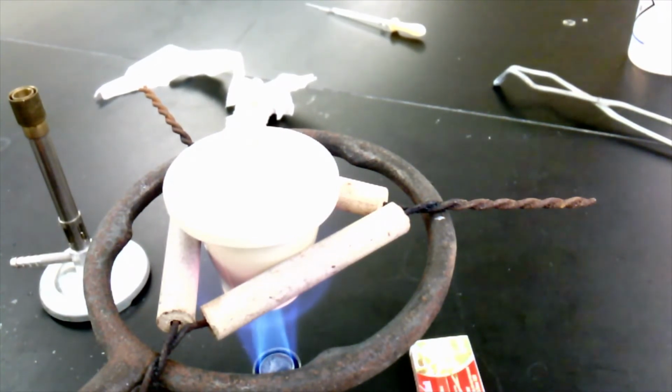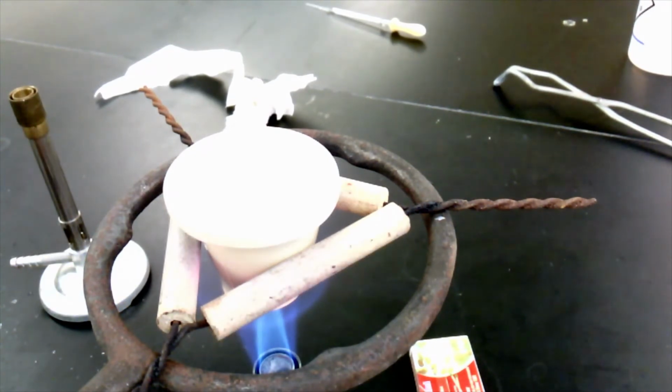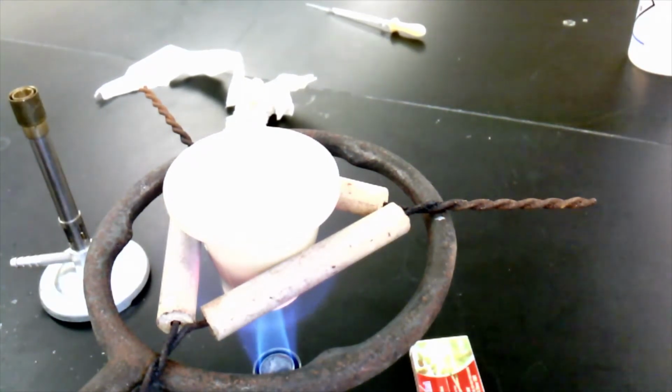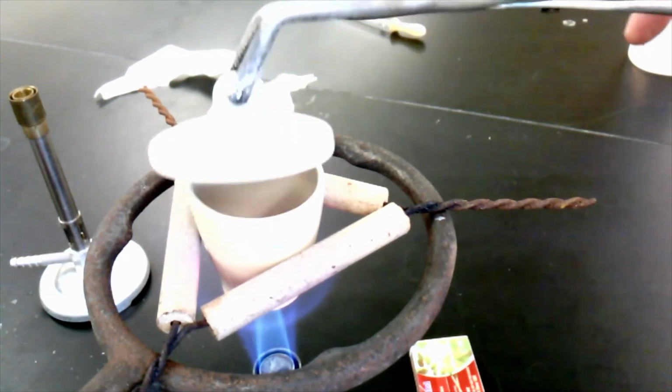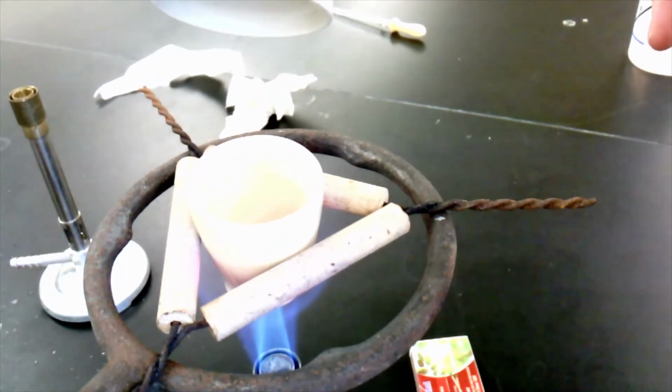But in case you forgot, there's a table at the very end of the lab report that has the formulas for all the relevant things that you need to know for today. For example, it tells you the formula for magnesium nitride. It doesn't tell you the formula for magnesium chloride or magnesium oxide because that's what we're trying to figure out today. But it tells you the formula for magnesium nitride, and that forms when the magnesium reacts with air.